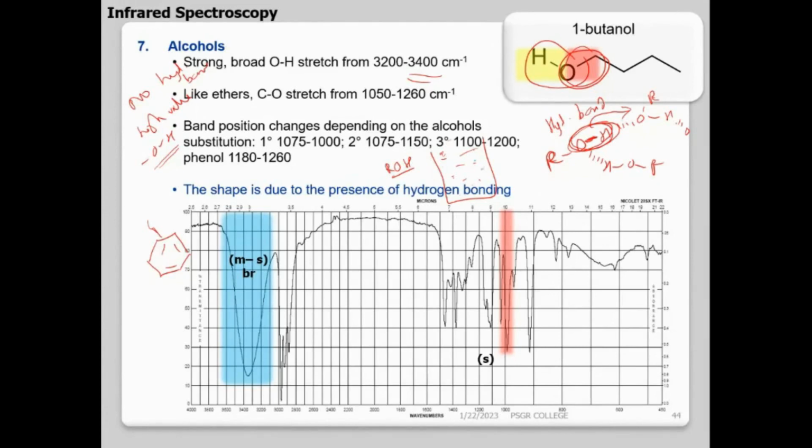Value எப்படி இருக்கணும்? Stronger, high value. So alcohol neat dilute solution, you'll be having a value around 3600. Hydrogen bondingனால value குறையுது, 3400 கிட்ட வருது. So if you have a highly diluted solution of the alcohol, you can find the value around 3600, very sharp peak. Broadஆ இருக்காது, sharpஆ இருக்கும். So hydrogen bonding இருக்கா இல்லையான்னு எப்படி கண்டுபிடிக்கலாம்? 3300 கிட்ட broadஆ இருக்கும். இல்ல experimentalஆ சொல்லுங்க, state வச்சு, என்ன state, solvent.